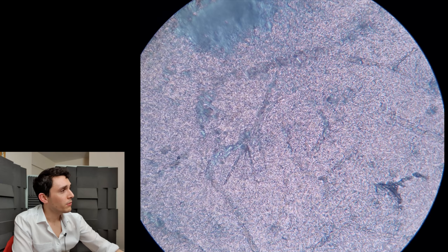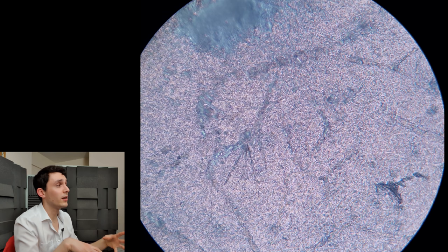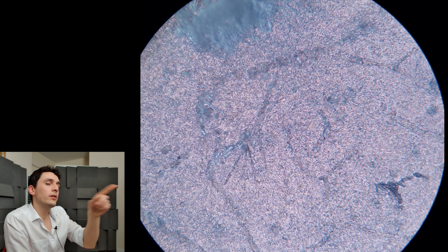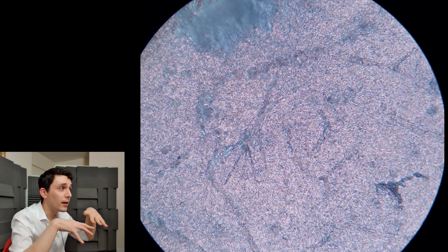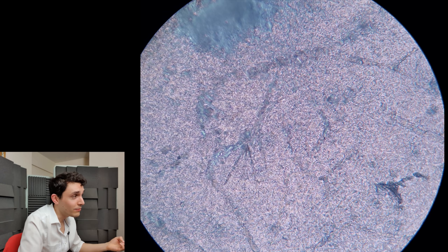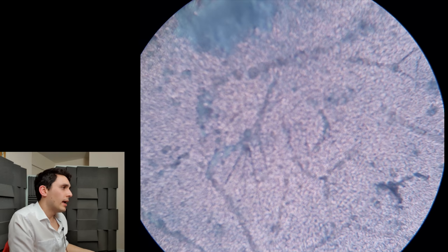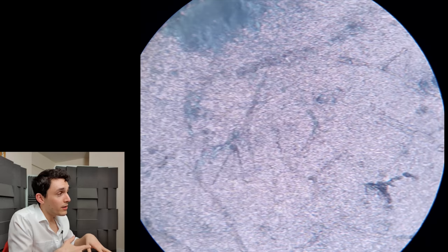I'm just going to pause here. This is a part of the slide that was thick, so the potassium hydroxide hasn't managed to clear all of the dead skin debris — the epithelium, the human tissue. But can you see any fungus lurking there? I bet you can now. It's lurking underneath or in the dead skin — you couldn't see it before because you didn't know what you were looking for. But now I bet you can see hyphae there. It's all throughout this dead skin in this very cool network.